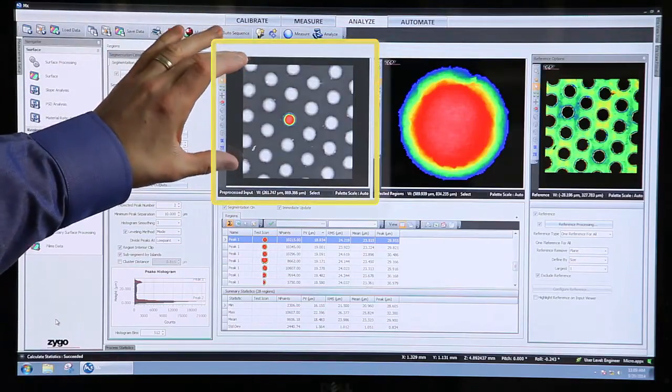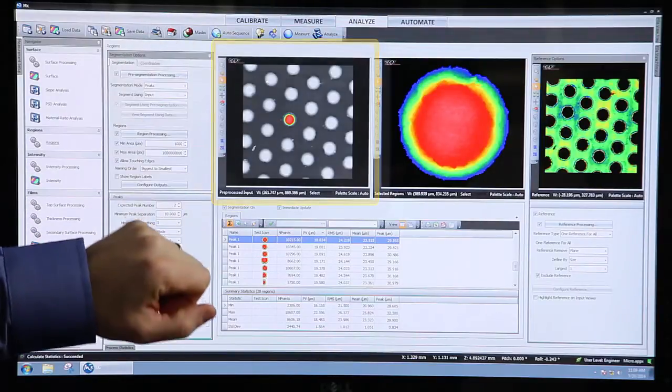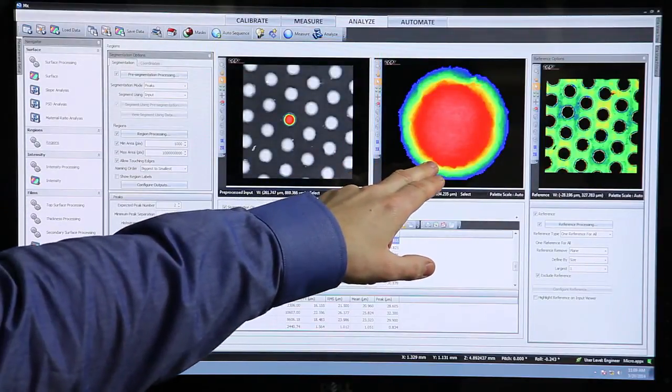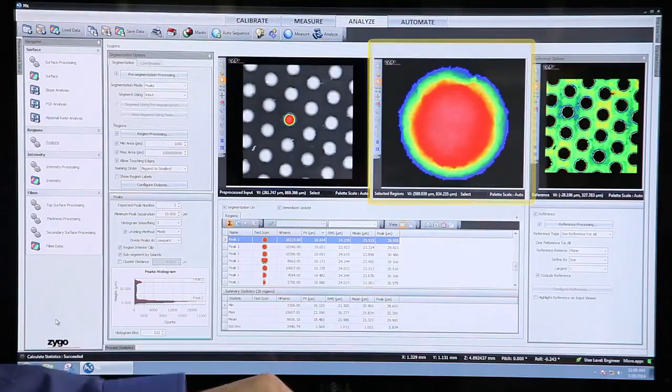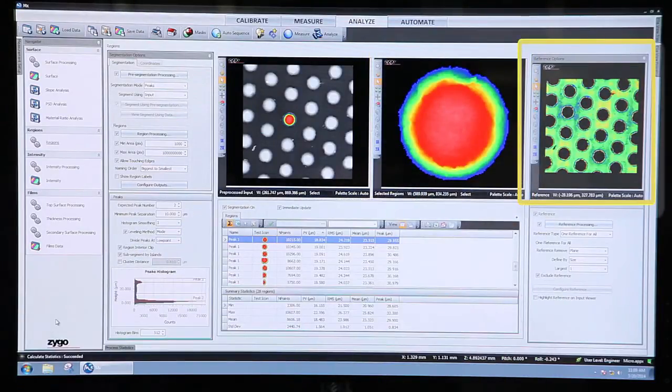It presents you your input data over here on the left, presents your active region, the one that you've got selected here in the middle, and then if you've got one defined, your reference region off to the right.